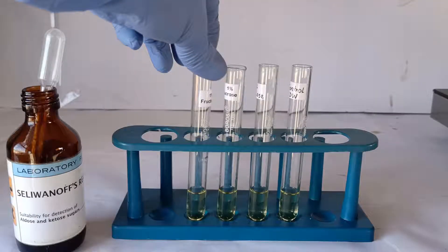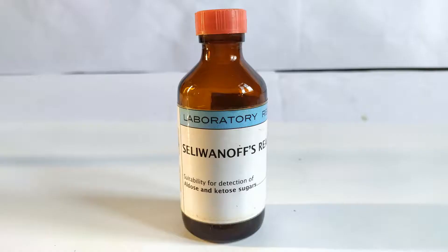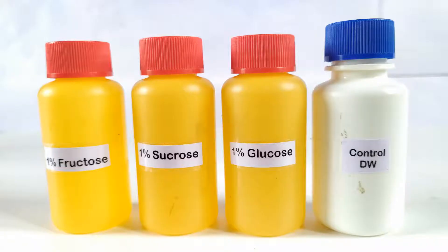In this video, we will be demonstrating a positive and a negative Seliwanoff's test on ketose and aldose sugar samples. For this experiment, we will need the following: Seliwanoff's reagent; sugar samples consisting of a 1% solution of fructose as an example of a ketose monosaccharide; a 1% solution of sucrose as a representative example of disaccharide and polysaccharide sugars containing ketose monosaccharide units; a 1% solution of glucose as an example of an aldose sugar; and finally a control sample of distilled water.